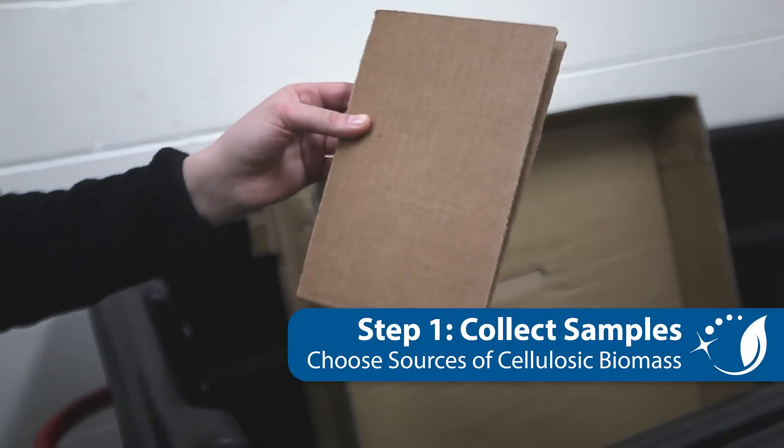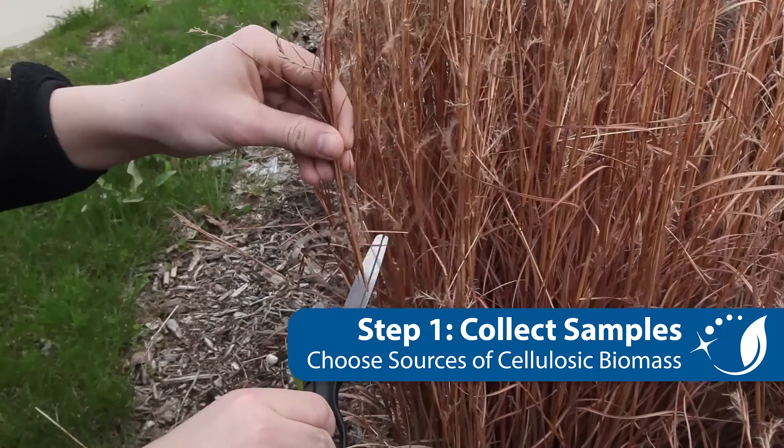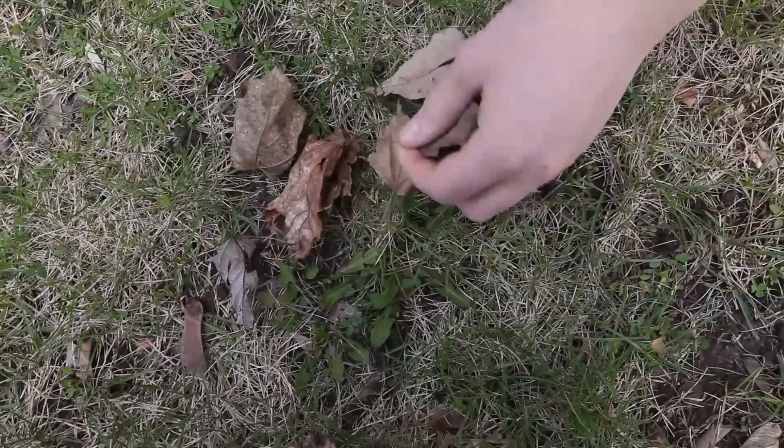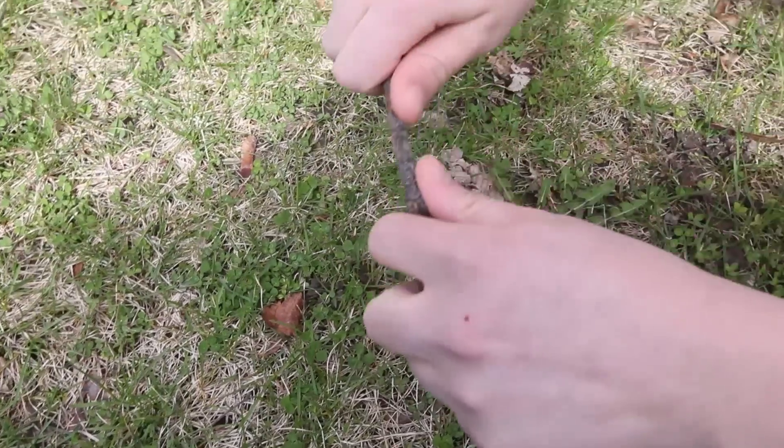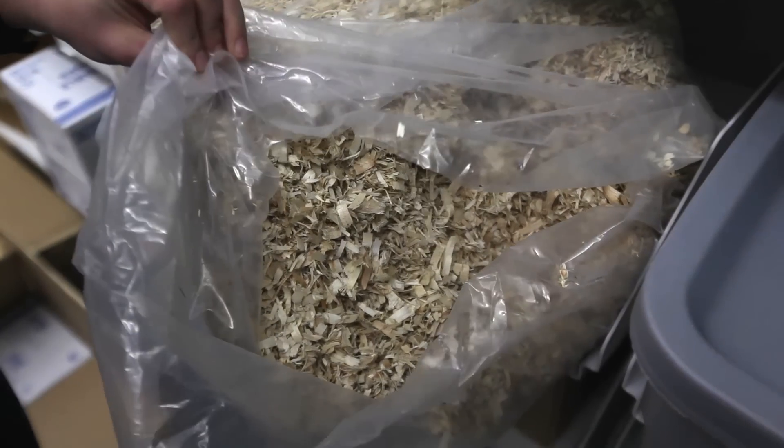The first step of the CB2E lab is to collect various samples of cellulosic biomass to ferment. Cellulose is a primary component of the plant cell wall and can be found in cardboard, paper, dried grasses and leaves, sticks, and pet bedding. Be creative in your search.